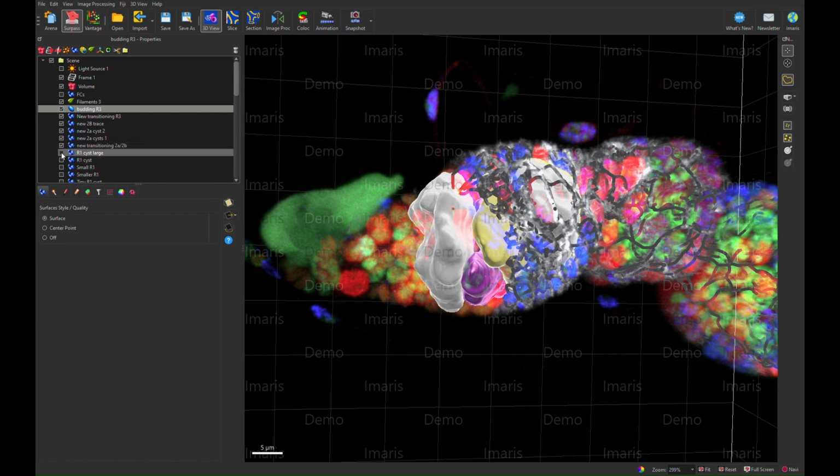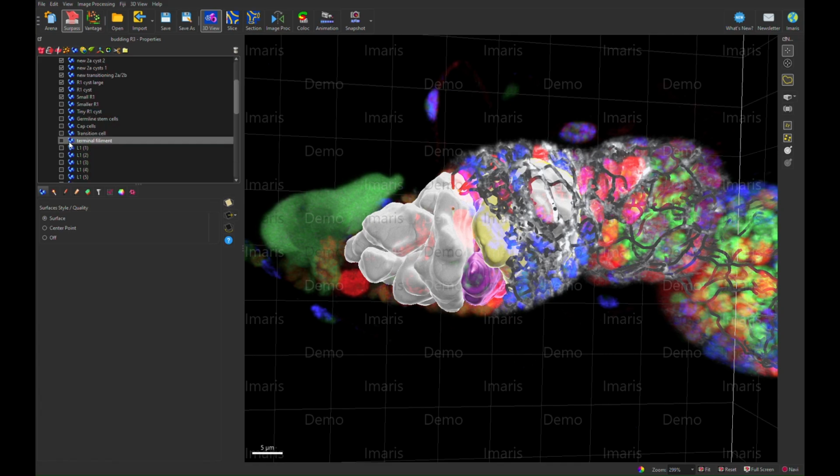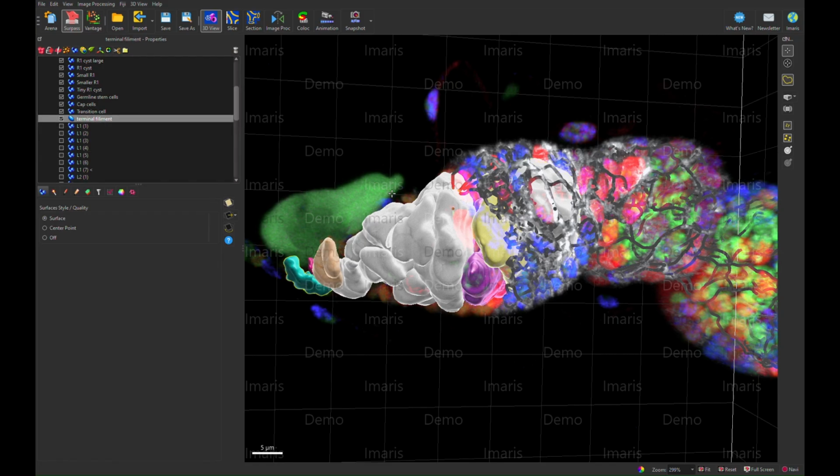In pink, we have a 2B cyst, which is flattened. And then in white, we have both 2A cysts at the posterior end going into the region 1 cysts, which are much smaller, being those 2 to 4 to 8 cell cysts. And we can see the Fas3 here, and all the way to the left, you have the cap cells and terminal cells. Popping up here in red are going to be the layer 1 follicle stem cells that are abutting the Fas3 protein but not surrounded by it.